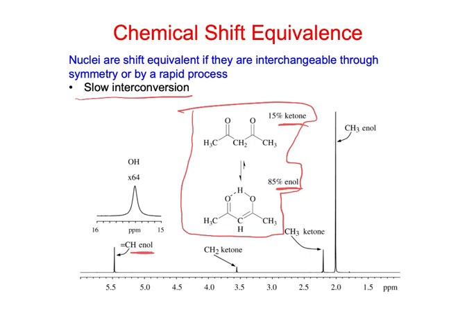So that's the bottom one. And here we have the ketone form. So this is a CH2 group, and so it's further upfield than the enol, where that proton is essentially on a double bond. Okay? And so, in fact, in this case, we could integrate these two peaks to give us the relative amounts of those two forms.